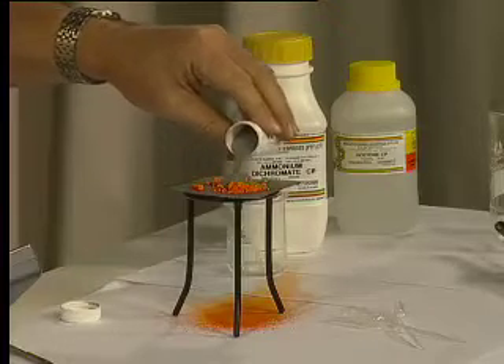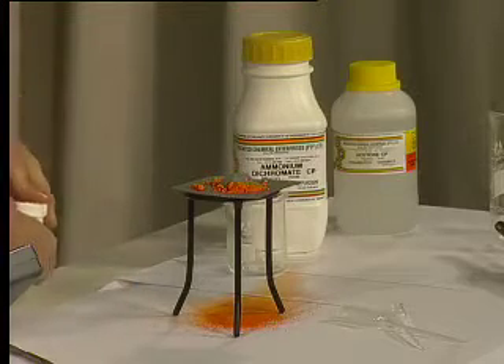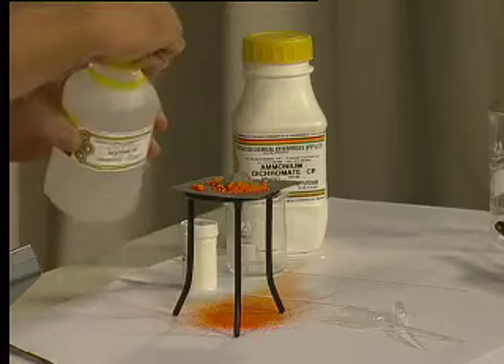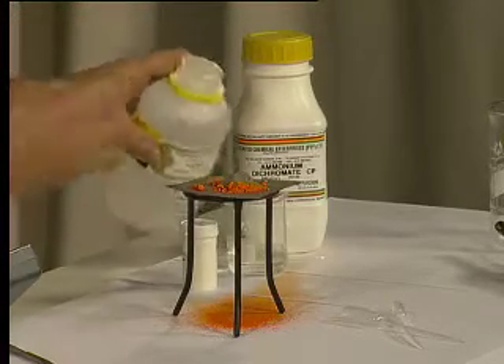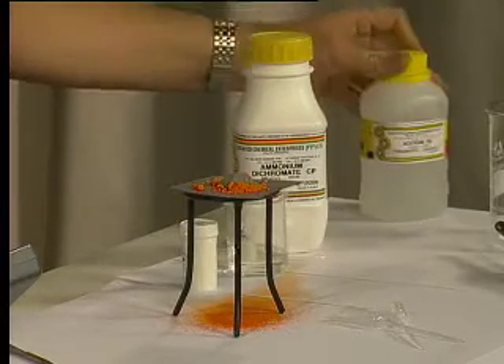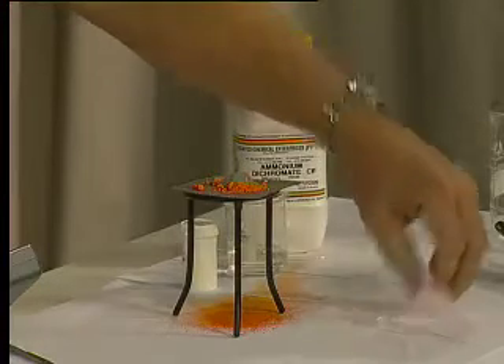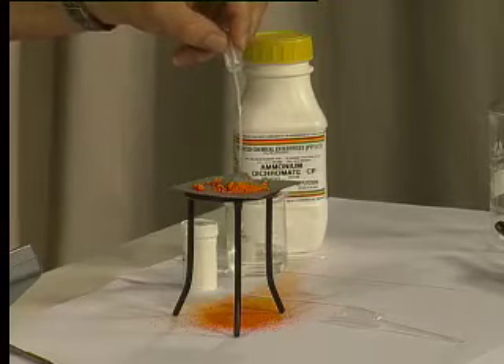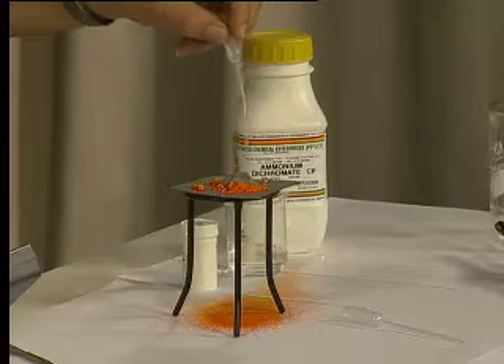I'm going to spice up the volcano a little bit by adding a few touches of magnesium powder, because when magnesium burns it sparks quite brightly, so it will add to the effect. And then, just to get it going, I'm going to add a few drops of acetone. Not a lot of acetone — we don't want a fire in here. We've already got the fire extinguisher on standby. I'm going to add a few drops of acetone to the top of our little table, which we're hoping is going to be the volcano. What we're going to see when I light that acetone is a really nice reaction.